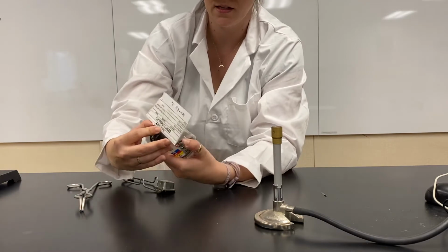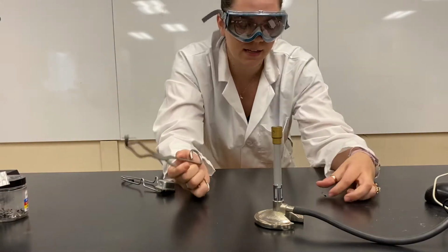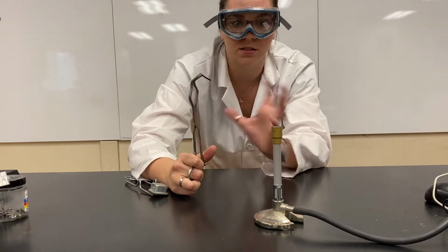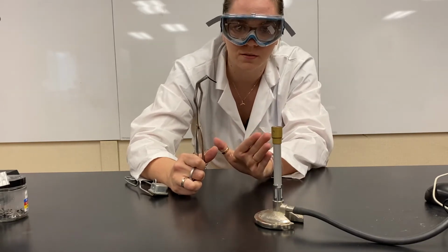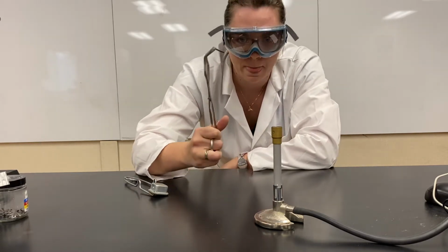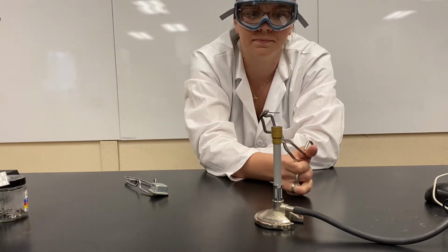And this is listed in your demo as a synthesis reaction because I'm taking magnesium metal and I'm adding it to oxygen to make magnesium oxide. True, it's also combustion because I have fire. Fire needs oxygen to survive. It's both types of reactions, okay? Here's magnesium metal plus the oxygen in the air.